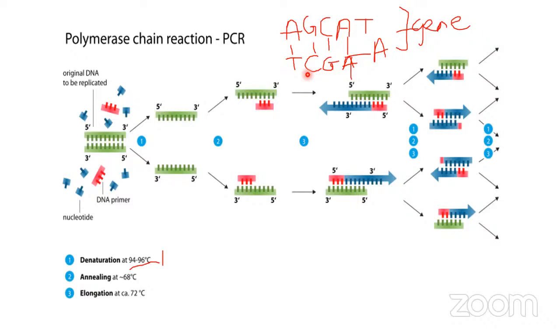So you measure the quantity to use, which is about 0.2 microliters for one sample, the small size. So what you do is you take the quantity you need for that particular reaction. So if you're working with 10 samples, you take primers enough to amplify the gene of 10 samples. There's a way to calculate it, to be able to know that you're using enough primer for the reaction that you want, not excess primers.